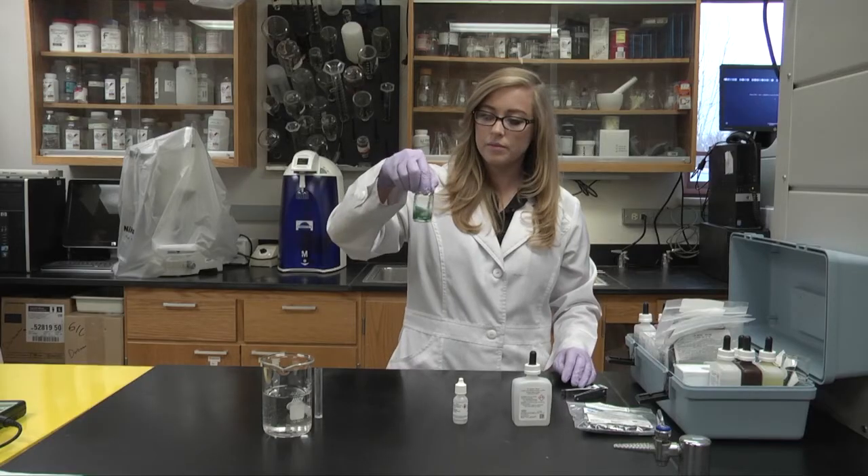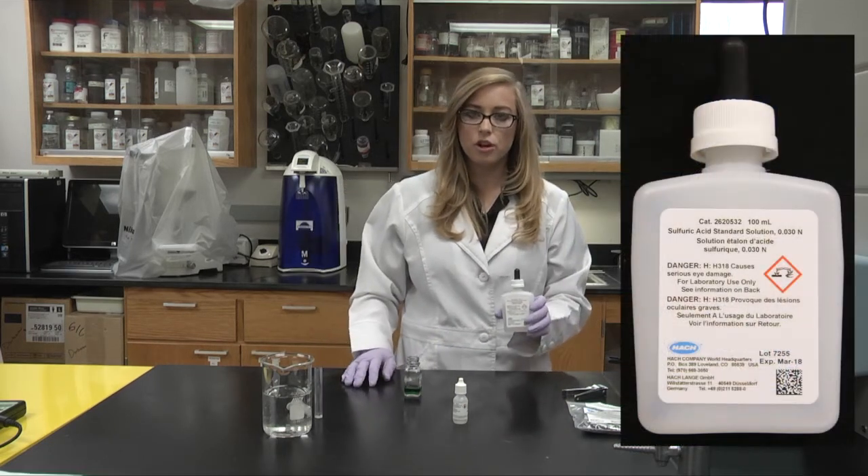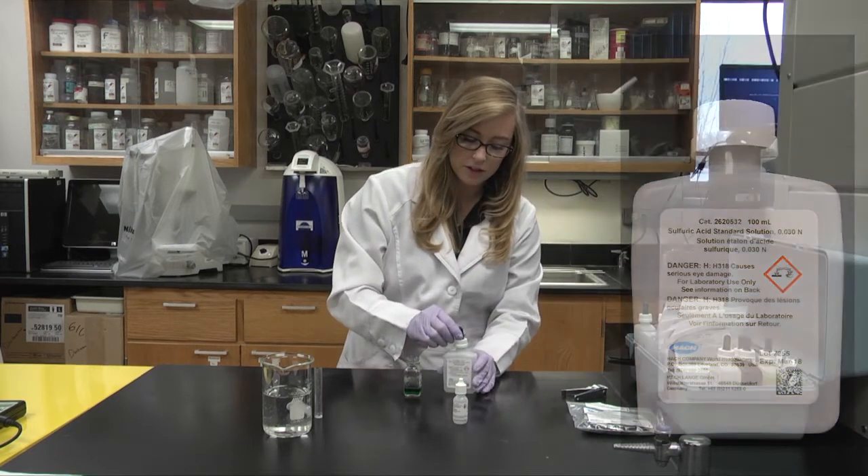Swirl to mix. Then you will titrate with the sulfuric acid until you get a color change. Be sure to count your drops, as we'll do a calculation at the end.